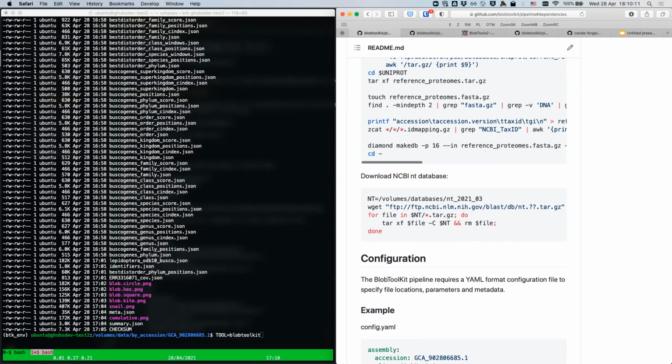Okay. What you're talking about was for Busco specifically. And what I discovered was that, and this is me doing all the testing for Rich. Rich does all the development. I do sort of the testing and outreach part. That's how we're breaking up our roles right now. And it turns out that there was one folder which was not being checked correctly. So even though the folder existed, Busco thought it doesn't exist, and it was going off to the internet and trying to download it again. And that's why it was probably breaking for you in V1 as well. And it was breaking for me in V2 as well. I fixed that now. So the latest version, at least I fixed it last week. So this version of the pipeline should not have that problem.